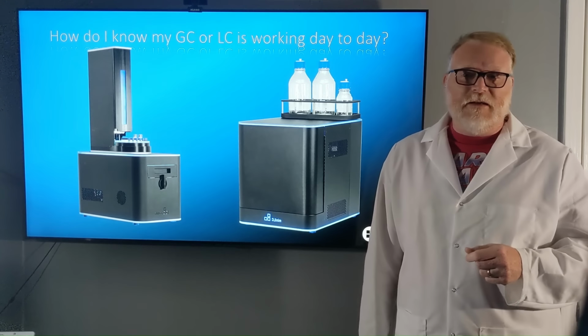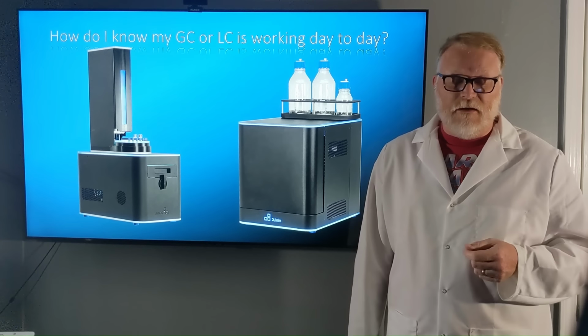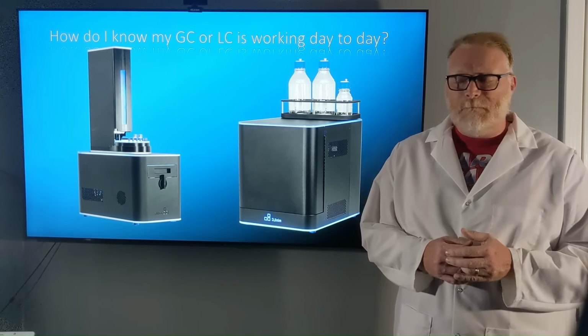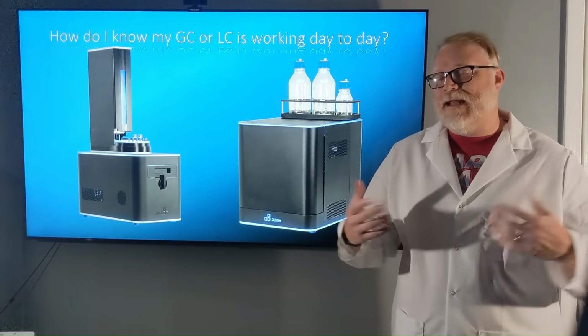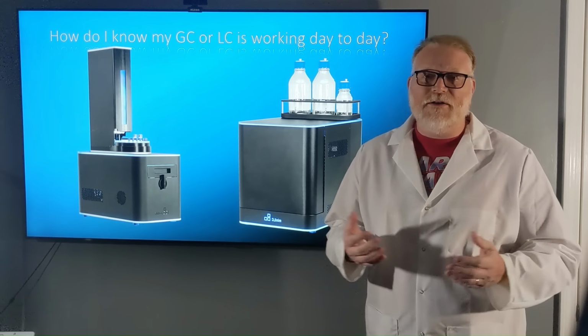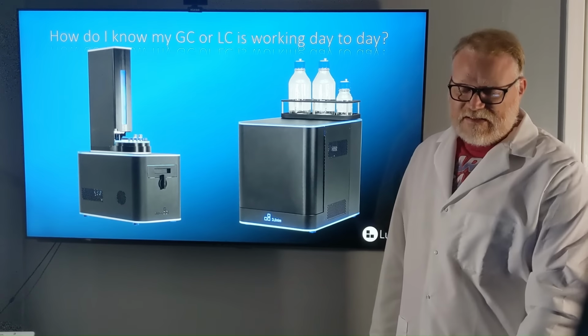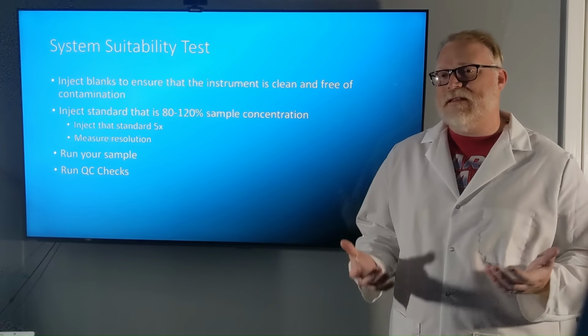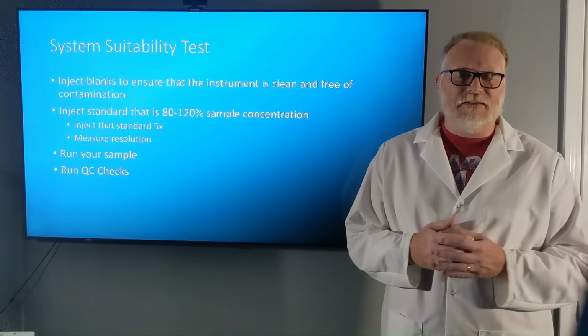You've purchased an instrument, you've installed it or had it installed, you've done the method development on it, you've done the method validation, but now you're 6 months in. How do you know that your system is working day to day, sample to sample, run to run? Well, that's where system suitability comes into play. So we run system suitability to make sure that the system is running properly every single time.